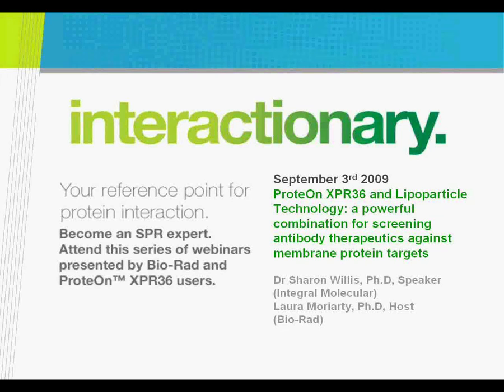My experience most of the time is with proteins, but of course with oligonucleotides, one of the classic ways to do that is to immobilize streptavidin or neutravidin, or you can purchase a neutravidin chip from Bio-Rad that's ready made for you, and then you take your biotinylated nucleotide and immobilize it onto the neutravidin surface.